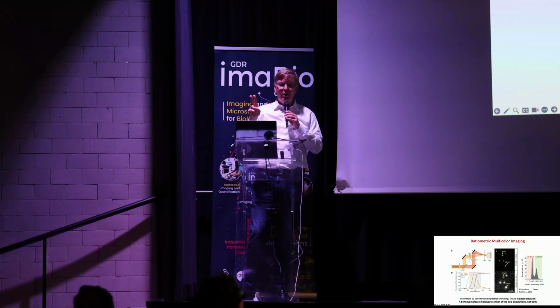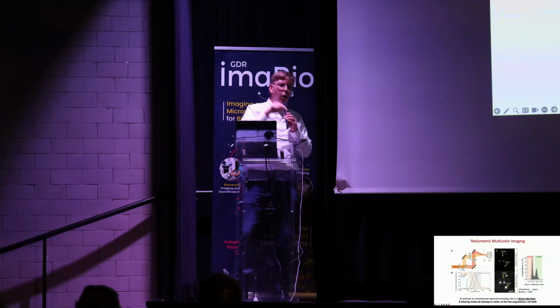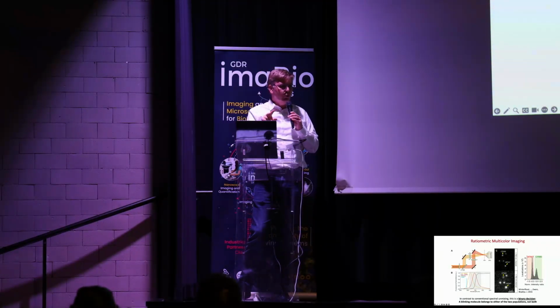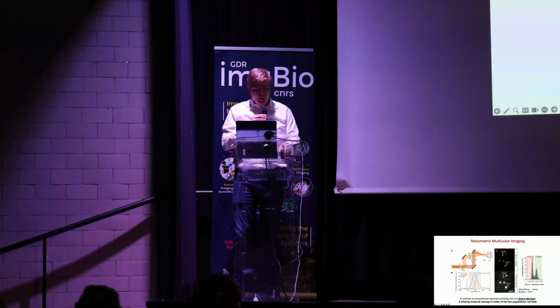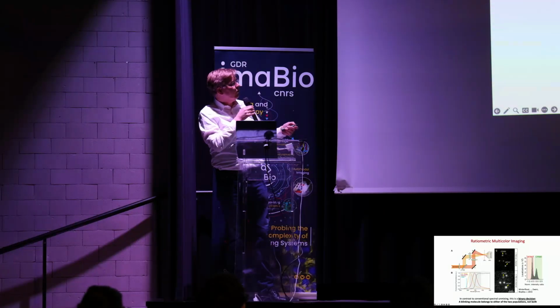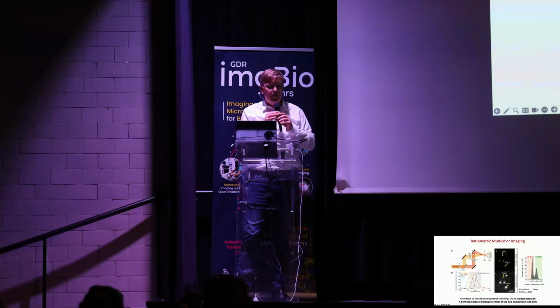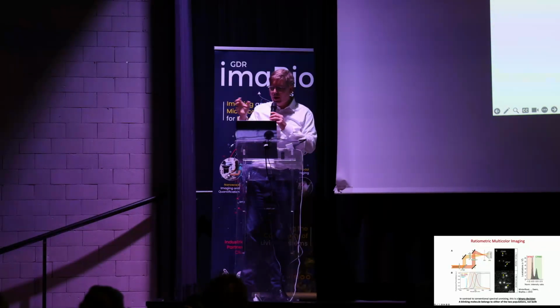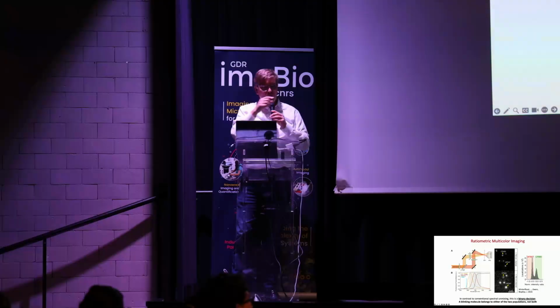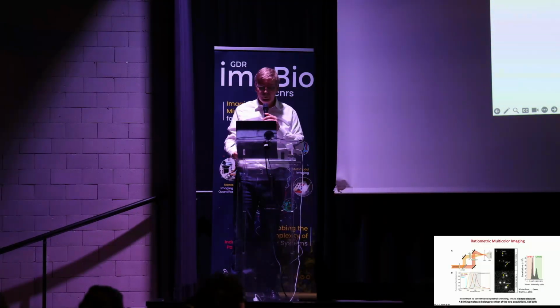You have to make just a binary decision, because you see single molecules, and you know it's either one molecule or the other molecule. It cannot be a mix of the two. And that makes that decision easier, and that's why we can relax these conditions much more. And even if the dyes are only 30 nanometers or so separated in spectrum, you can easily distinguish them. I mean, in our case, we can do 3-color imaging, using 3 dyes essentially in this color spectrum, and still only throw away about 5% of the localizations, which are just here at this minimum where it's ambiguous which dye they are.